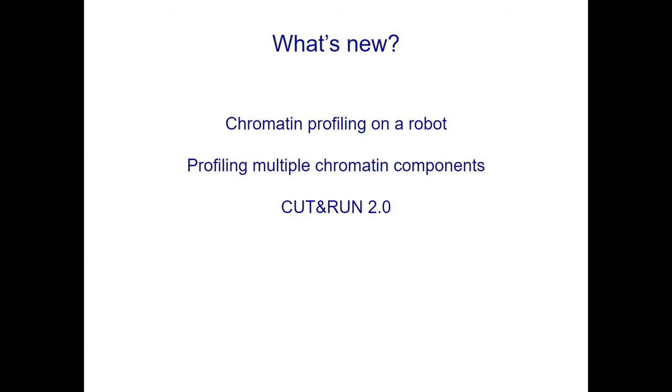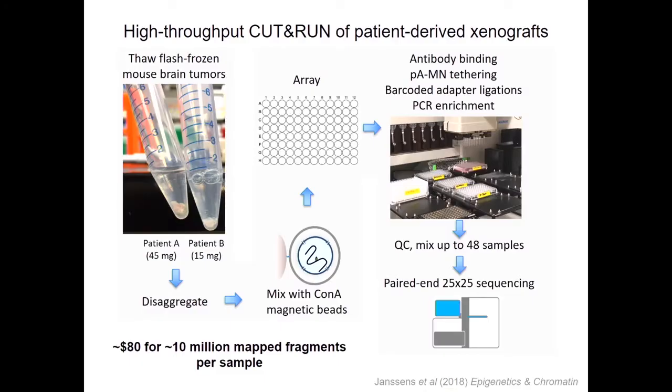Okay. So we want to look at many different cells and many different epitopes. And so the way that we've been doing this is converting this into a fully automated robotic platform. We use a Biomek liquid handler in the robot. This is the work of Derek and Jay in the lab. And they were thinking about different kinds of samples you can put in, either cell lines, dissected tissues. In this case, this is xenografts of a tumor, a human tumor that's grown in mice that we can then treat. And actually, it doesn't really matter what you use.